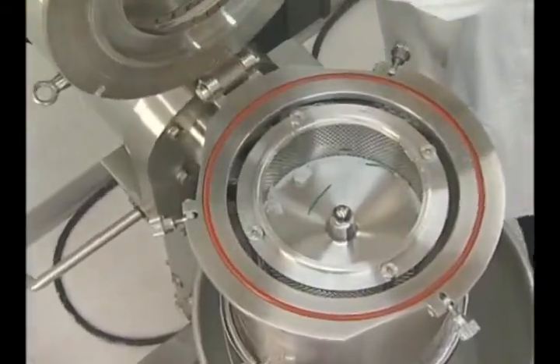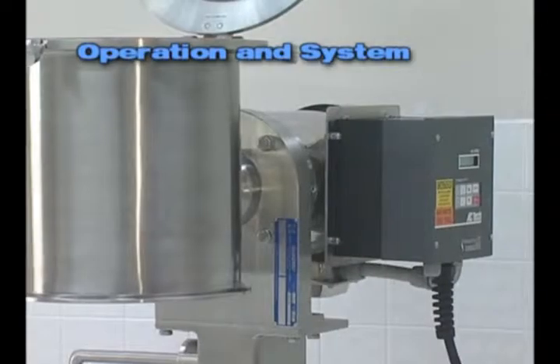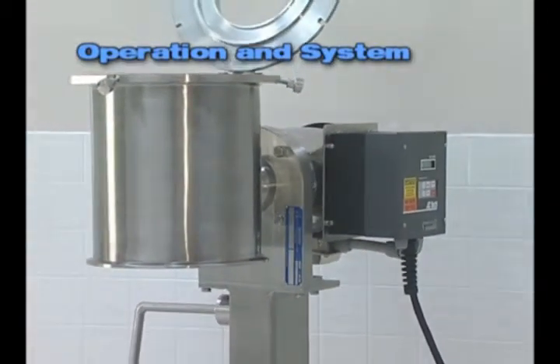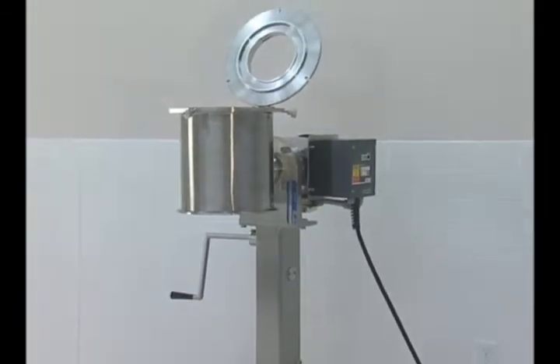As you can see, the Quadro Sifter effectively retains the impurities. As compared to traditional vibratory sifters, the Quadro Sifter does not employ vibration to sift the material entering the action zone.